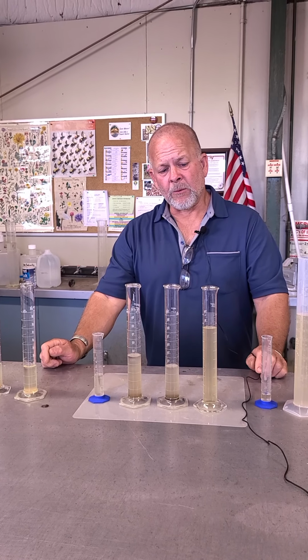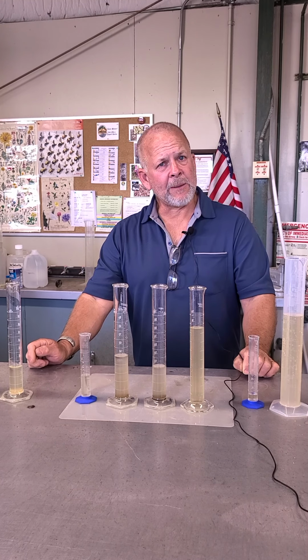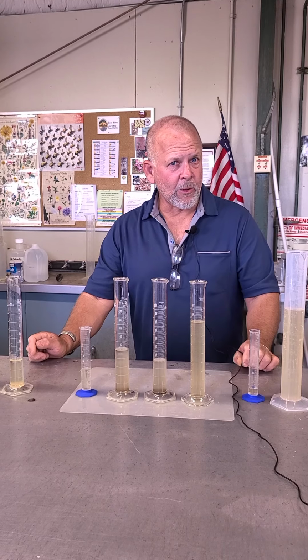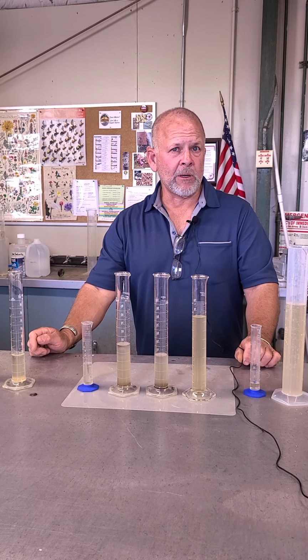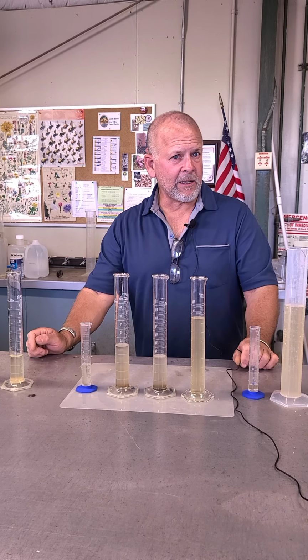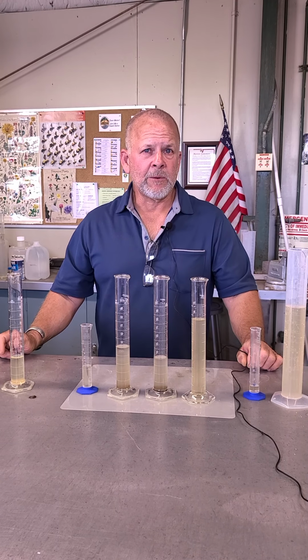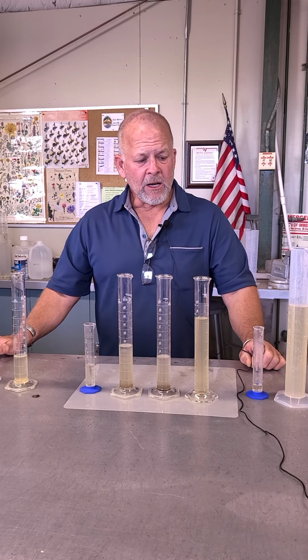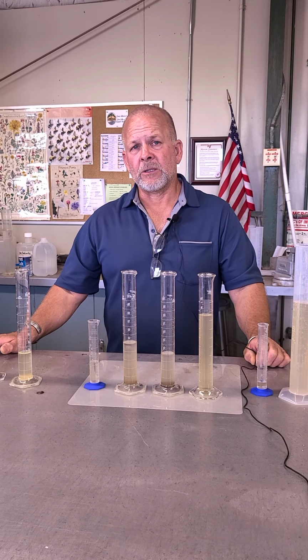So remember, what we're trying to ascertain here is how those different types of salts and different concentrations of salts actually will affect water movement through soil. And we added the different variable of looking at 3 quite diverse soil textures to see if there would be any comparison across soil textures. Now, we've got to make a few more runs before we can really get some data that we can actually use. But here we go. You kind of see it visually on the first run. So we'll go ahead and run the other ones, and then you'll get all the data presented to you in your data sheet.